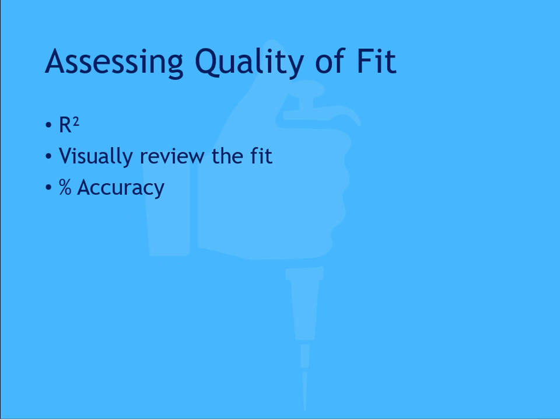The well-established 4PL and 5PL fit methods used in MyCurveFit and MyAssays products and services are tried and tested and in routine use in thousands of laboratories and organizations worldwide, so you can be confident of reliable results. These fitting functions are easily accessible and usable in different scenarios. For general curve fitting, MyCurveFit and the MyCurveFit XL add-in are excellent options.